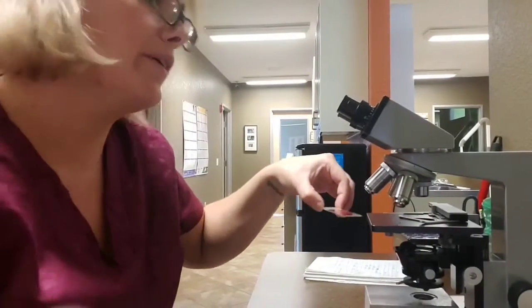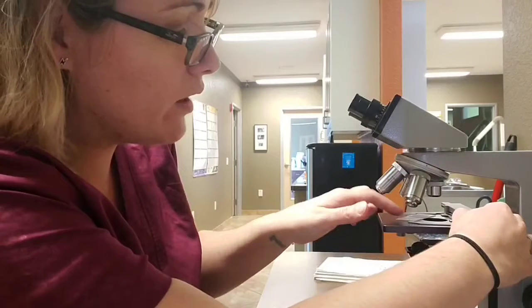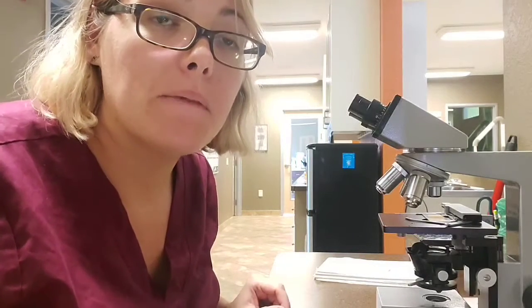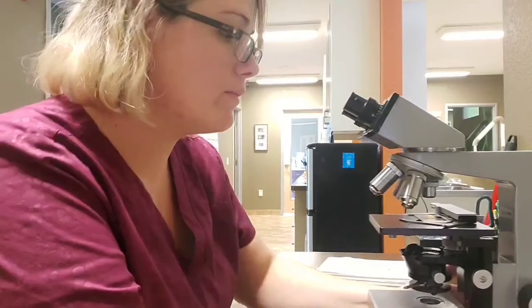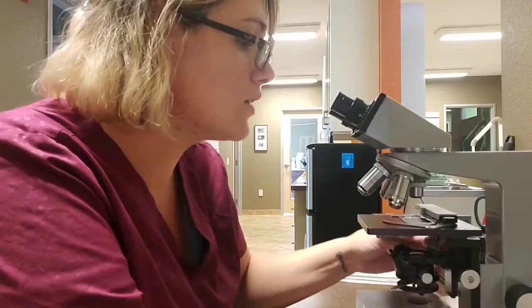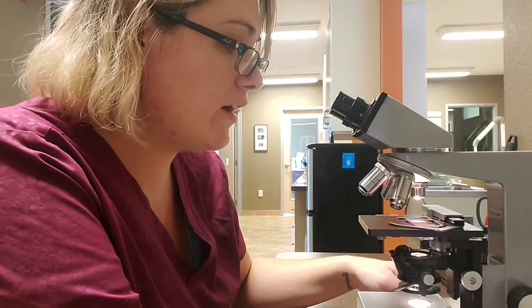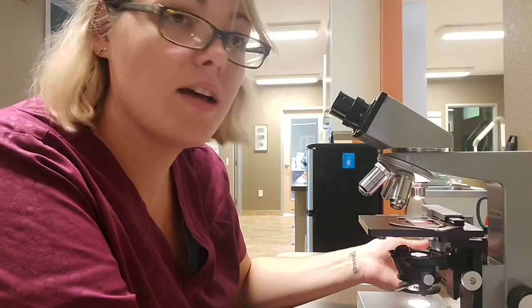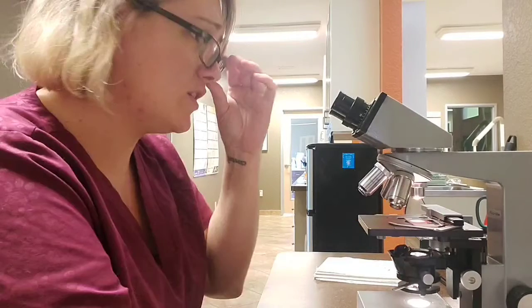and then from there we will come on over to our microscope here. And what we're going to do while observing for this is we're obviously looking for microfilaria, looking for a positive heartworm test. But the goal is that we are going to look at it under 10 times magnification to see if anything's present. So I'm going to get us started there.